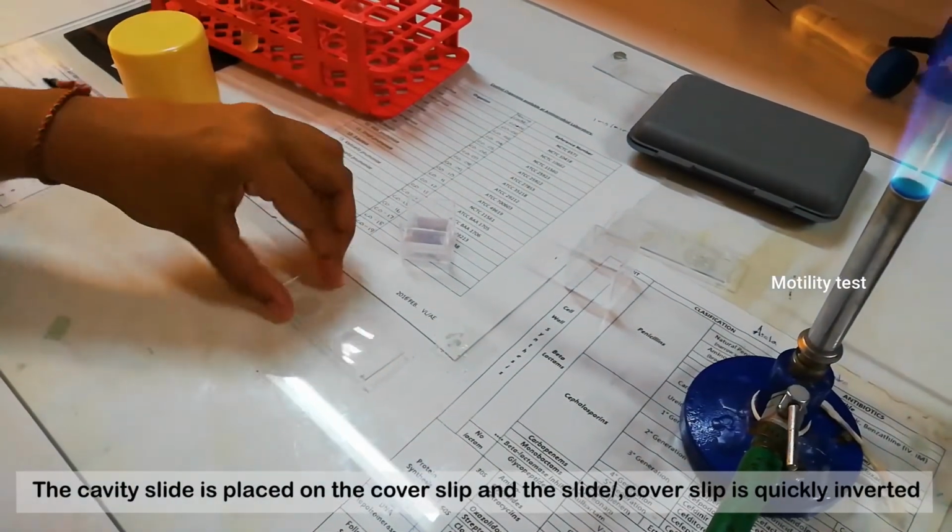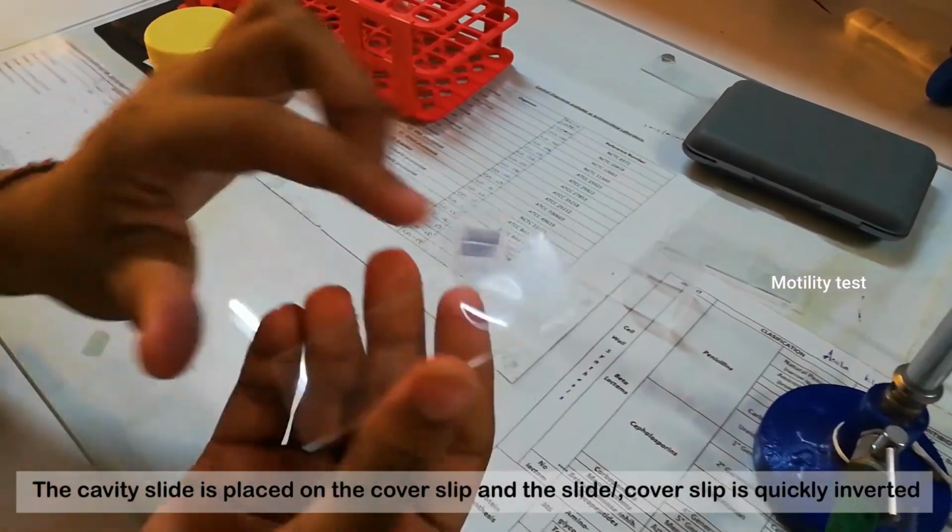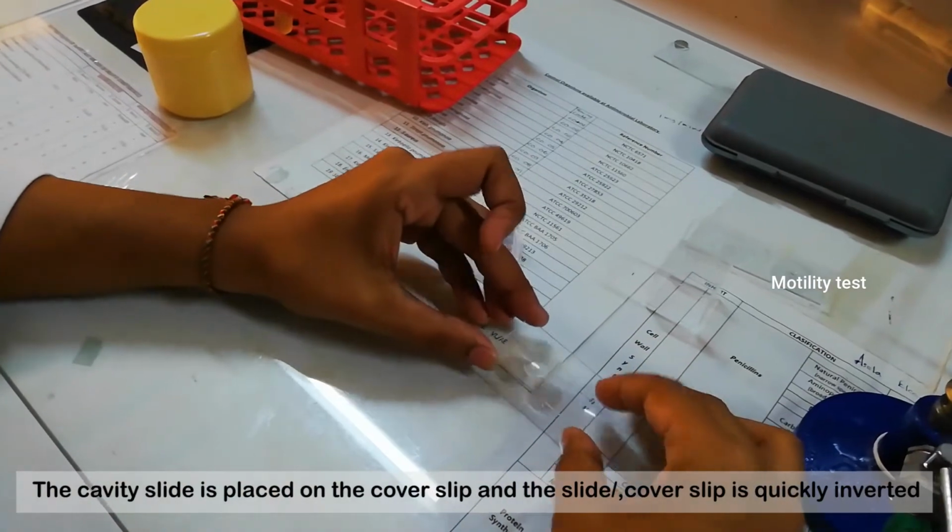The cavity slide is placed on the cover slip and the slide with cover slip is quickly inverted.